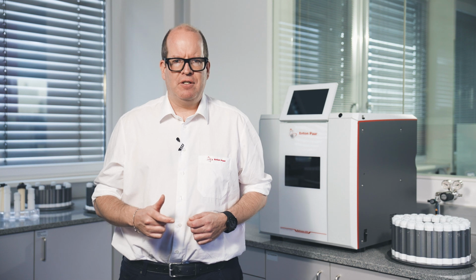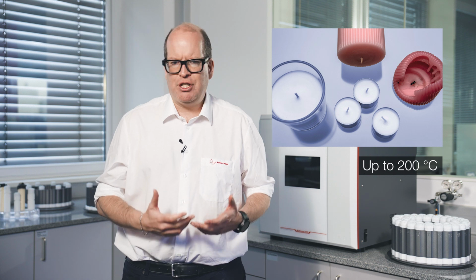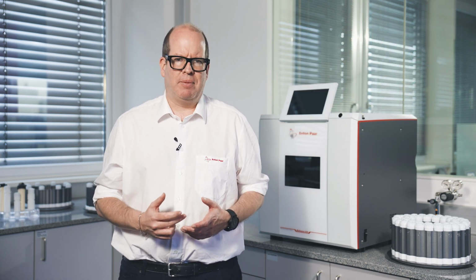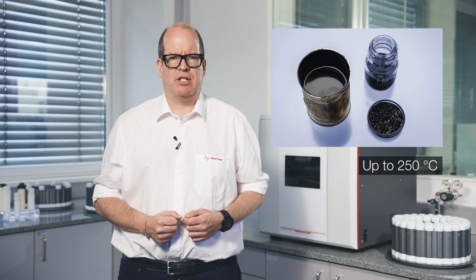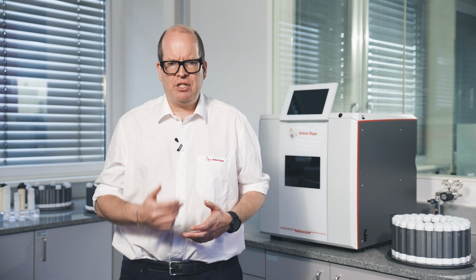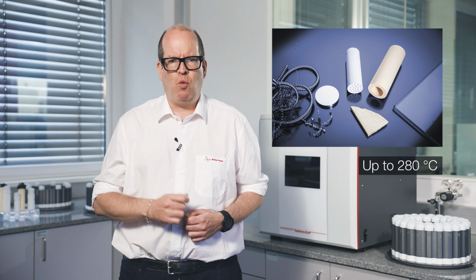A few examples. On the organic front, aliphatic hydrocarbons, including heteroatoms, require temperatures up to approximately 200 degrees centigrade. Aromatic hydrocarbons, including heteroatoms, temperatures up to approximately 250 degrees centigrade. And inorganic samples often require even tougher conditions, up to 280 degrees centigrade for 1 or 2 hours.